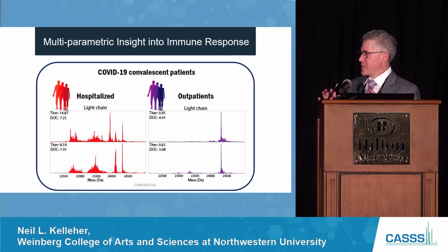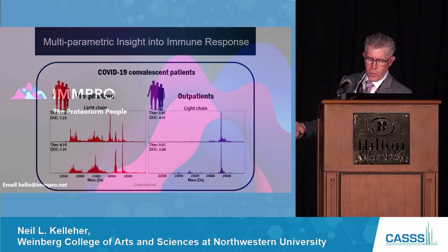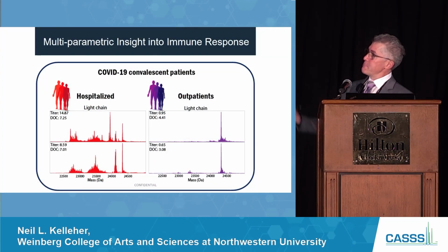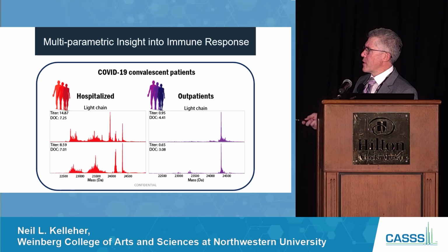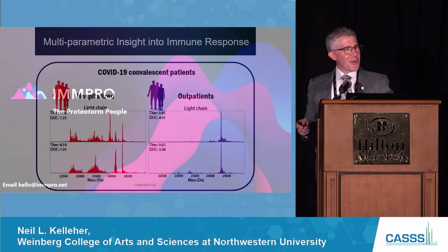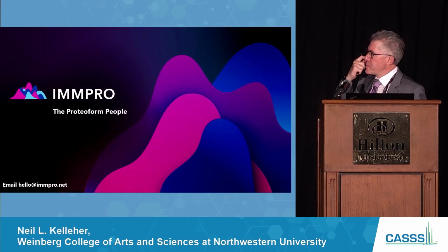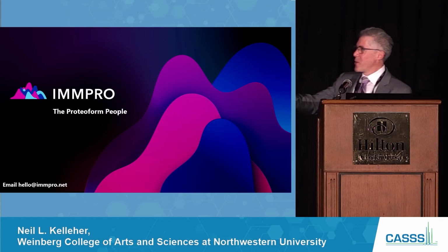Right, long COVID, the simple answer is no. But what I can show you is the deep COVID. So this is someone with 3 weeks in the hospital, with obviously more clones and more titer, high titer, which is known if you have severe COVID and your immune system is battling that off. Whereas these were between 1 and 2 weeks, and these were more 3 to 4 weeks, so it's not apples to apples. It would be very interesting to look at long COVID. That's about where the lab stopped and pivoted. We are interested in sequencing those clones, absolutely. We're technology developers.